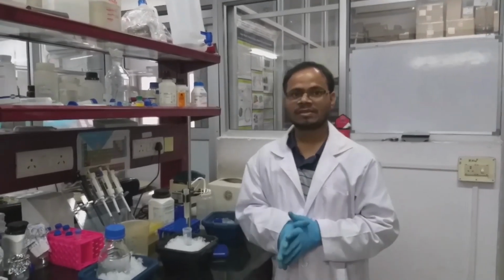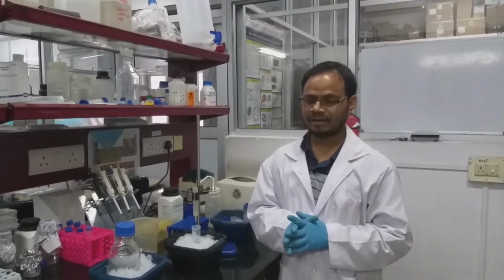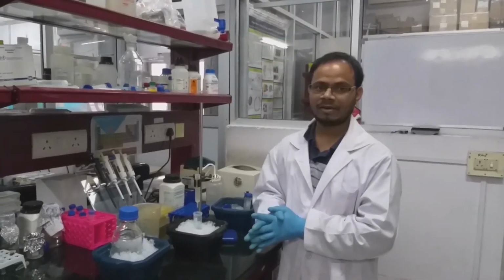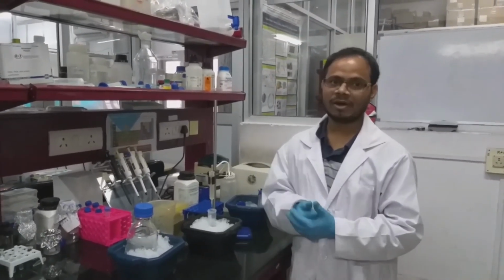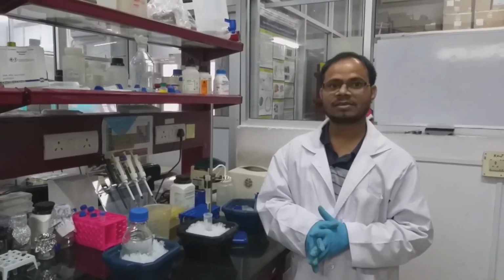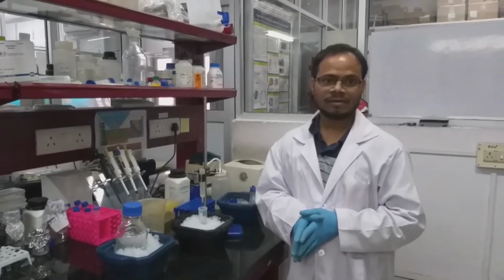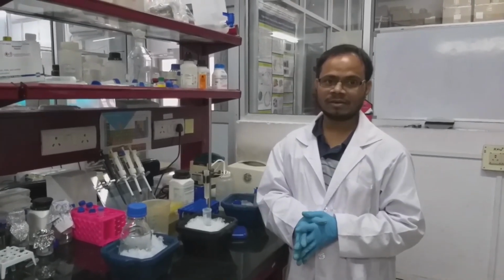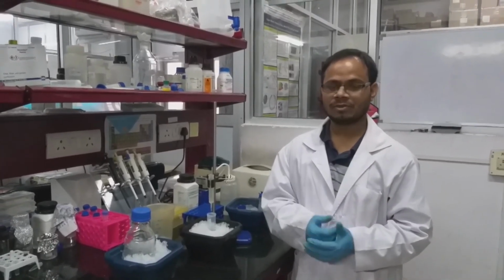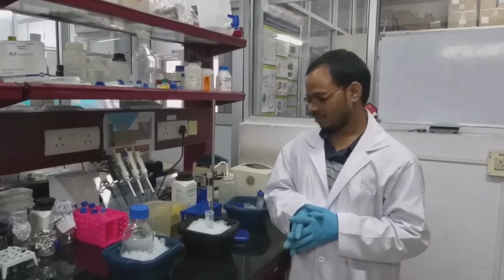For all these buffers, the pH should be adjusted beforehand. It's not like you first take the lysis buffer and then add imidazole, because that may increase the pH of the buffer. So after compiling all the lysis buffer with the imidazole, then we have to adjust the pH so that throughout the procedure the pH won't change.